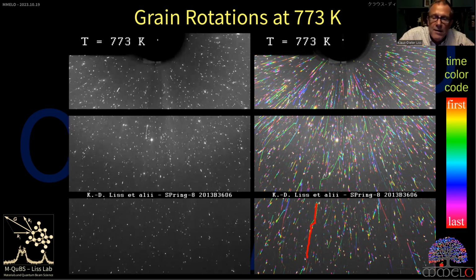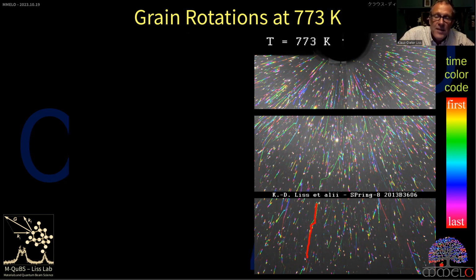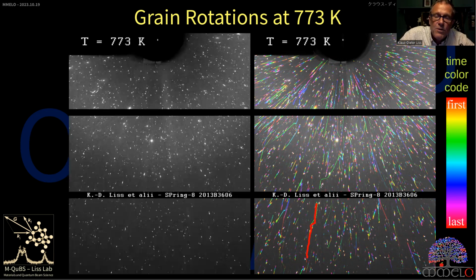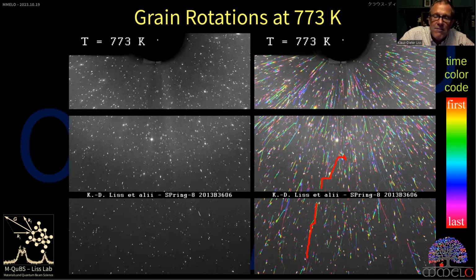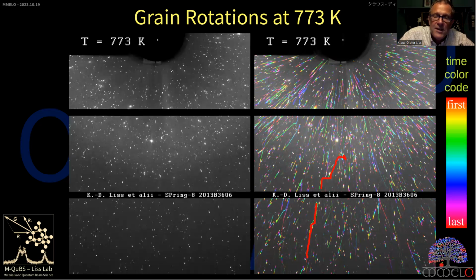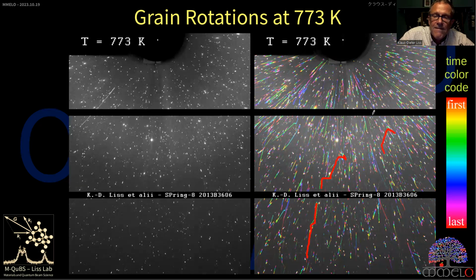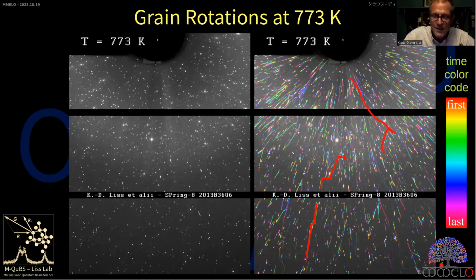And another one, it's not a continuation of that one, I worked it out, but another one starts eventually here to move, and then it goes this zigzag way. And there's a reflection of that same grain which goes this zigzag way, somewhere to the up. I'm not that accurate here with the mouse.